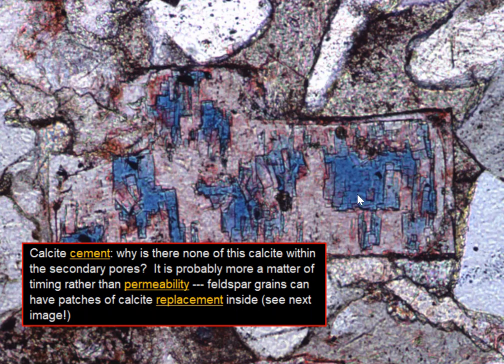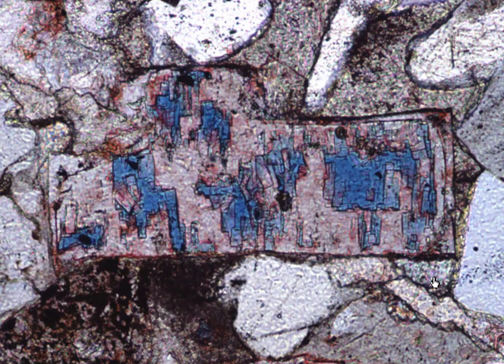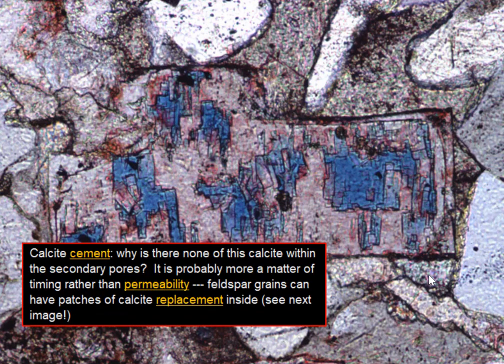We have our blocky feldspar grain, and then into that primary pore space, a calcite cement deposited and grew from the initial groundwater. We don't know whether the groundwater then changed composition that made it more likely for this to be dissolved. Possibly these areas that are dissolved were contributing calcium so that the calcite could form.